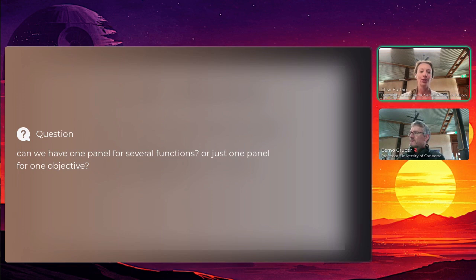You'll see when we go through and play with the data that some questions, like population differentiation, so FST, are actually really easy to generate. You only need about 10 or 20 loci to get really good estimates of FST. So you can select a panel that gives you just a few of those to get your FST, and then you can select another panel to add to that, to help you look at other questions like levels of heterozygosity or levels of inbreeding, for example.